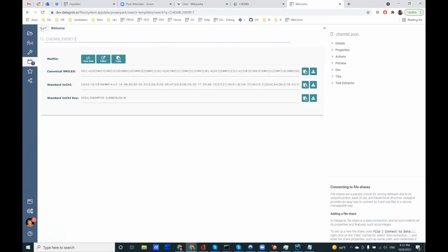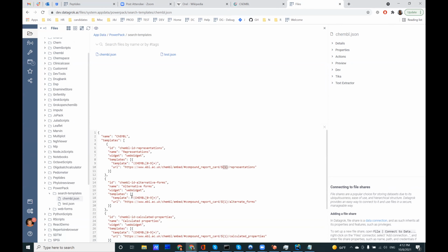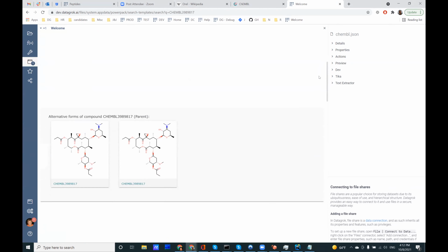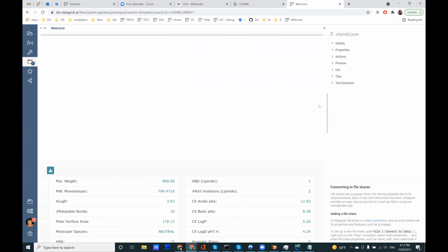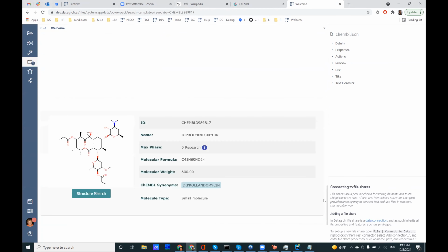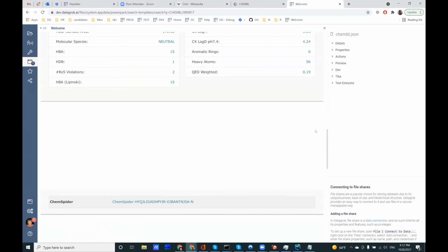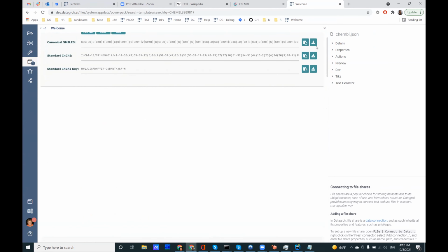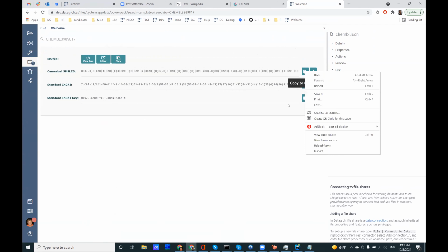Right, so it got matched with a number of templates and all of the different widgets get shown. We can scroll down to see different projections, different representations of what is found here. What's really nice is that it requires no code. It's super simple and could be extended, maintained, and curated by other users.